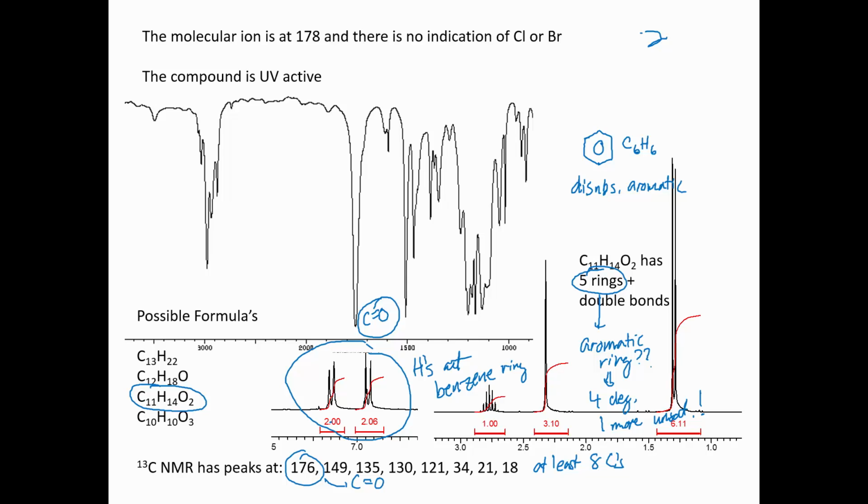Let's now consider what else we can find in this molecule. Here we have a doublet, 6 hydrogens. We've seen that pattern in the NMR section of this chapter, and that's almost always an isopropyl group of some sort. You see that not only do you have the doublet of 6 hydrogens, but here we have this hydrogen that's heavily split by 2 different methyl groups. So here we have a septet.